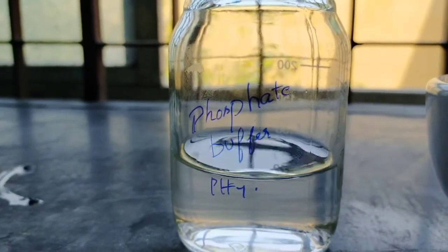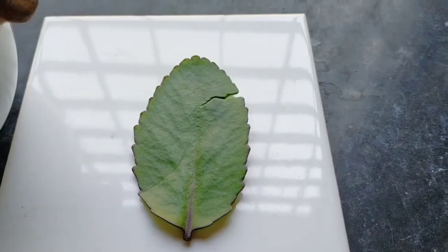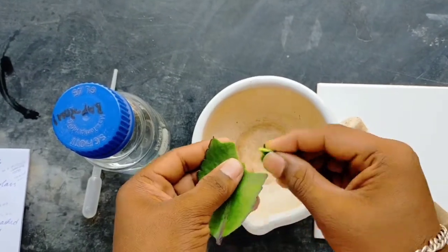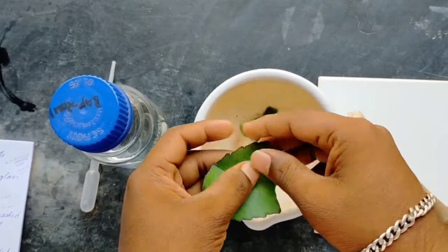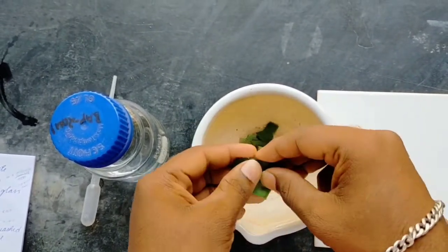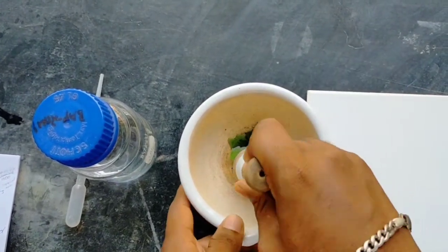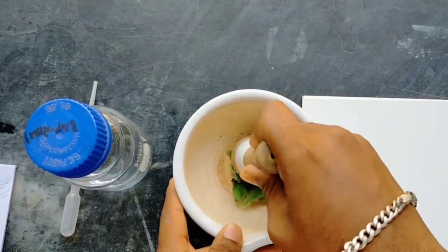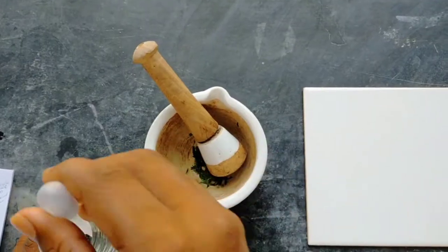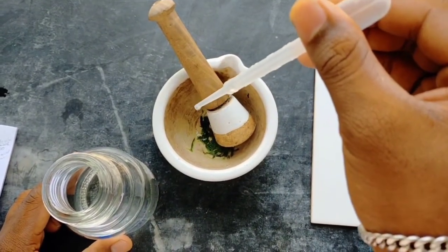Materials required: phosphate buffer, mortar and pestle, plant sample. Young fresh leaves are taken and made into pieces. Crush it nicely. Add few drops of phosphate buffer and grind it nicely.